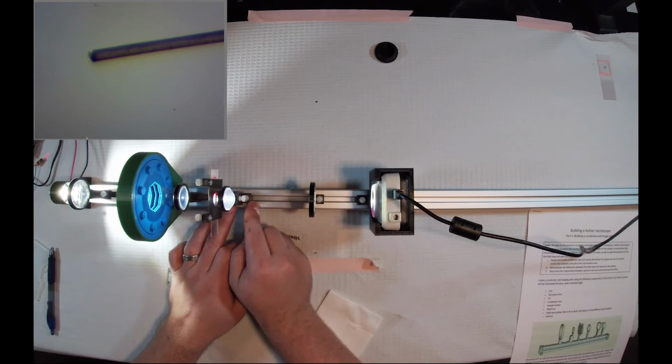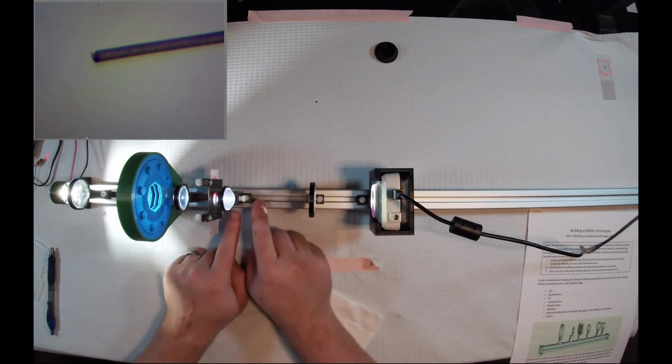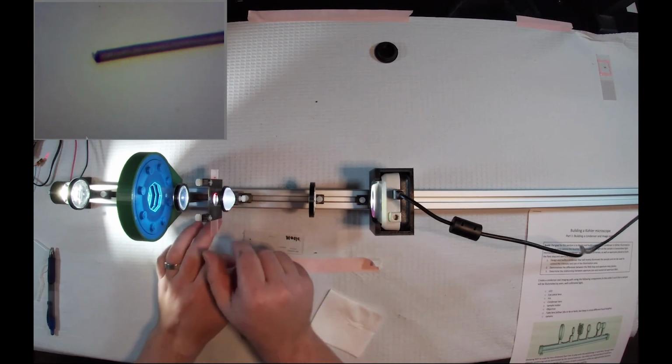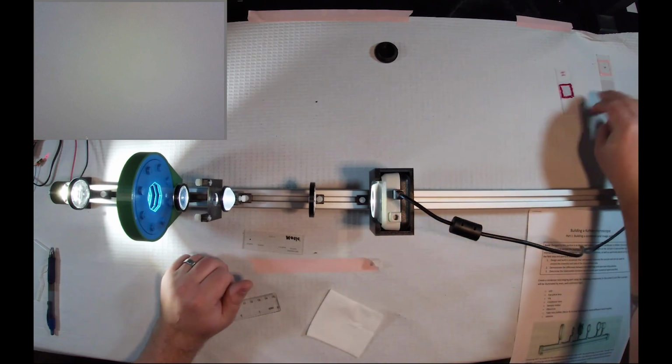You get more absorption at the edges because it will refract light away from our objective lens. But overall, much darker than the background. So that is what hair looks like under a Brightfield microscope.